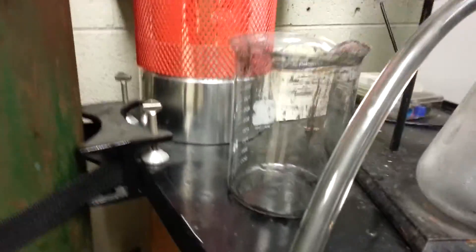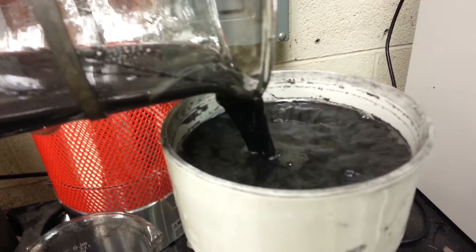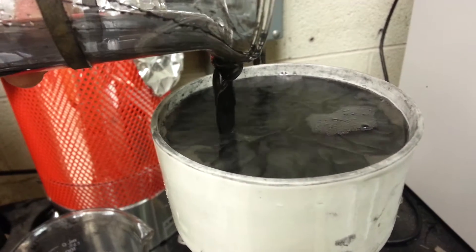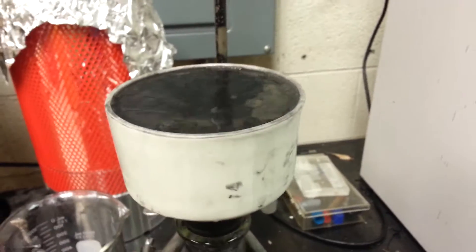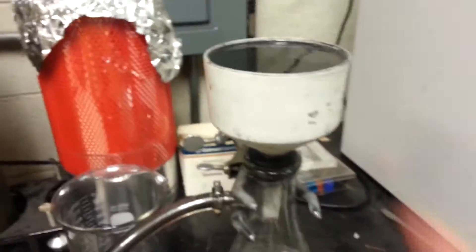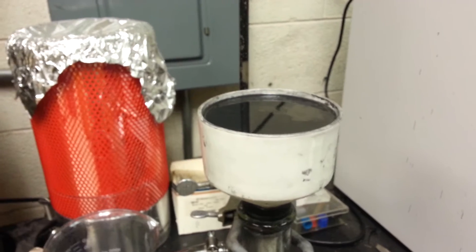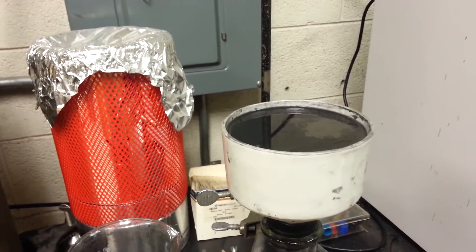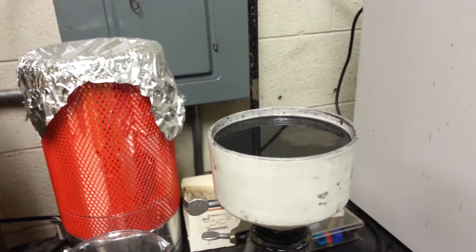You plug this in there, hit the machine on, and you pour it. Now, mind you, there's a machine that does this process — it's called the filter press. Google it, look it up on YouTube. There are neat videos about how the filter press works, and boy, is it so much easier. You can literally do tons of this stuff every few minutes.